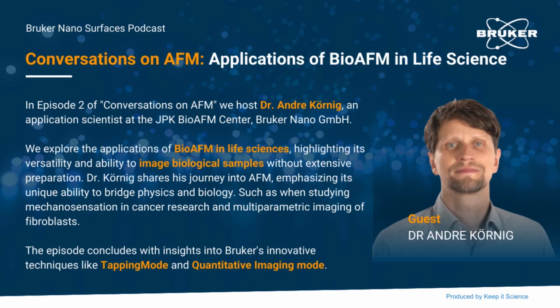Well, yeah. So fibroblasts, exactly. They're quite handy cells. They are quite robust. That's why we also use them for general imaging, because you can try a lot of things with them. So I like them as well. If you're not a biologist, you might treat things a bit differently, and they forgive the, let's say, physical approach of using them. We have some colleagues that are biologists, and they sometimes shake their heads when I just use it as a tool, let's say.